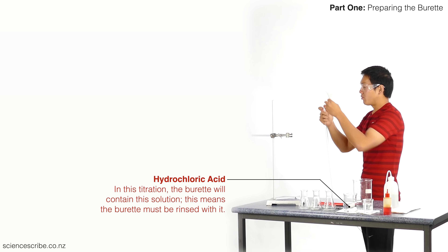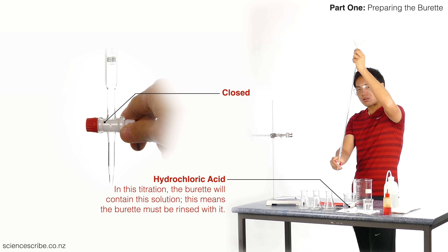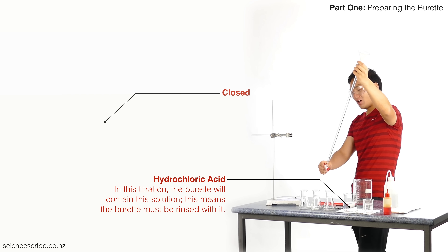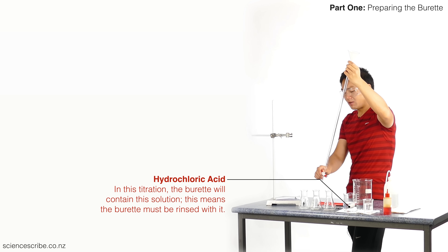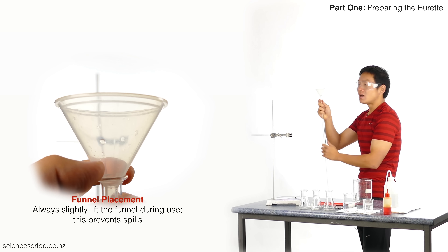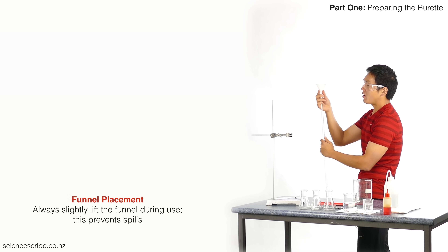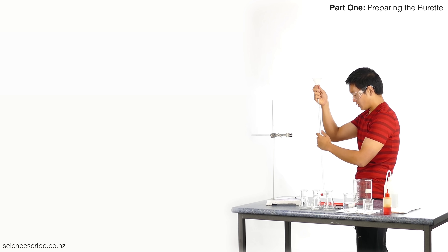I'm going to check that the stopcock is in the closed position, because the last thing I want is to fill liquid into the burette with it in the open position and get a spill everywhere. So check that it's closed. I'm going to hold my burette in one hand, place my funnel over the top, and lift the funnel just a little bit above the burette so I don't create any pressure inside.